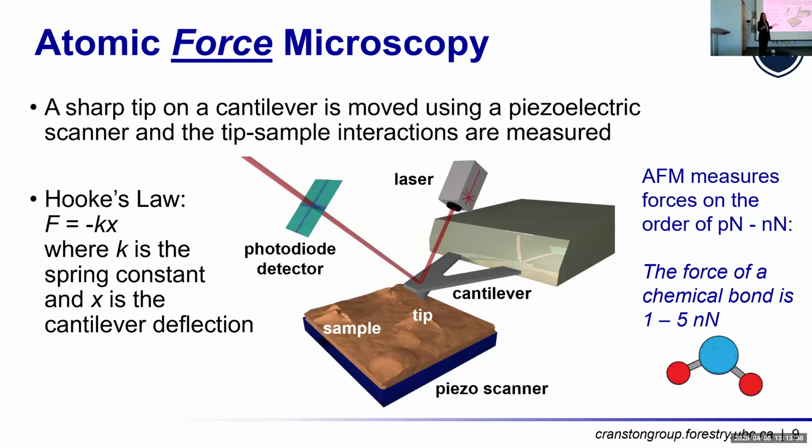And there's different ways you can image. You can push hard on the surface or push soft, or you can tap along, or you can barely touch it at all. And those will give you different kinds of images. But again, today I'm not going to focus too much on the imaging. The force part that I've underlined here is that this tip is actually touching the surface. So now we can measure forces, we can measure phase, we can measure how stiff or soft a material is, or we can bring materials together, pull them apart, look at adhesion, look at pre-contact forces.